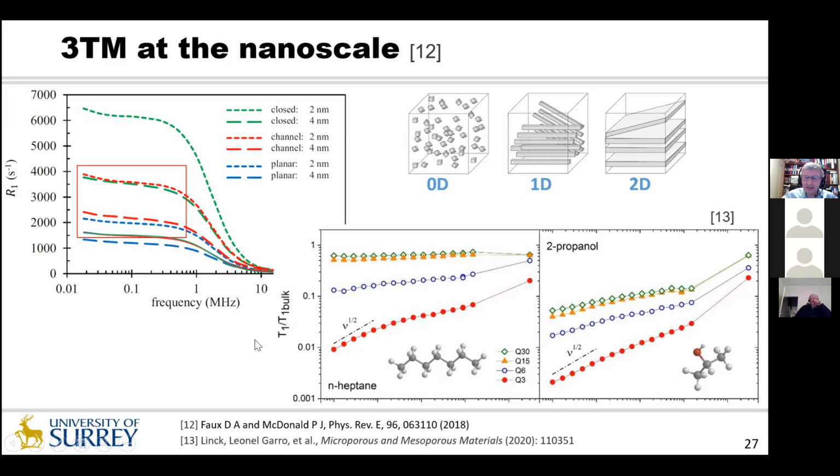The authors, Link and co-workers, have the relaxation time as a function of frequency, so they've flipped over. But if you look at their sequence here, and you look at the red curves here, and imagine it flipped over, then the similarity between those 2 sets of data is really quite encouraging, I'd say politely.